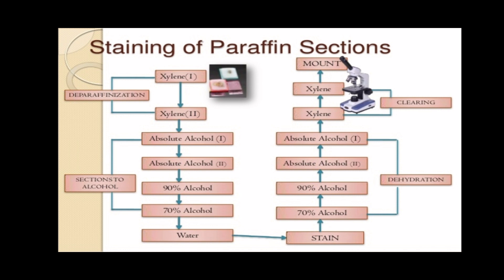Subsequent sections may float off the slide during staining for no apparent reason. Possible causes include dirty or greasy slides, or sections not left in the paraffin oven long enough to dry and be fixed. Sections must be left in the oven for a minimum of 30 minutes before staining. If not feasible, sections should be fixed in a Bunsen burner flame in the same manner as when fixing bacteriologic smears.